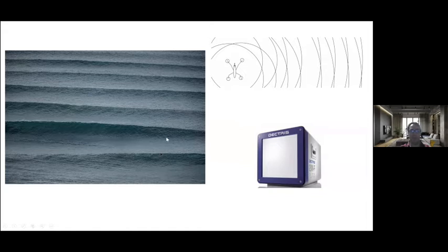These waves are coming in, and they're interacting with the water strider or surfer. And then at the beach somewhere, you're measuring the difference between what it was like without the surfer or water strider in there versus when it was on a detector. So you're just watching how the waves have changed as a result. So that's the sort of basic idea of the experiment.